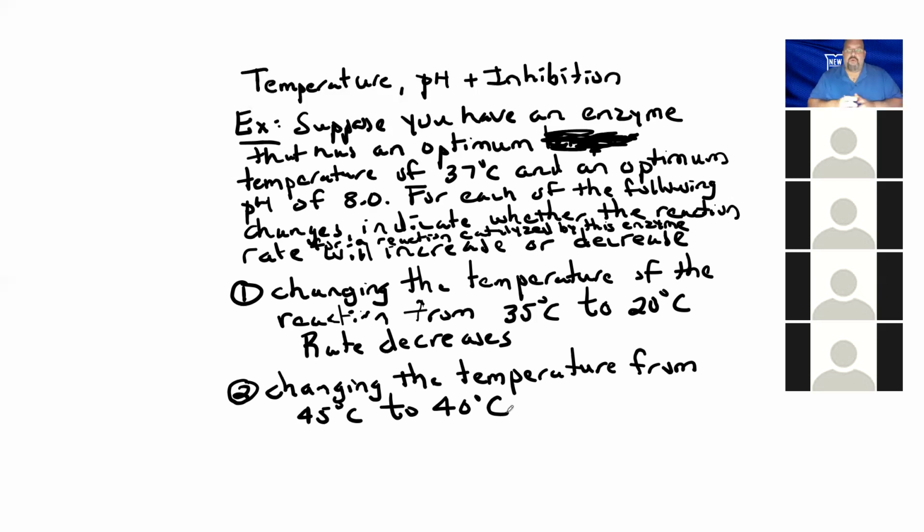Okay, so now we have the same reaction where the temperature is at 45 degrees Celsius, and we're going to lower the temperature again, from 45 degrees Celsius to 40 degrees Celsius.